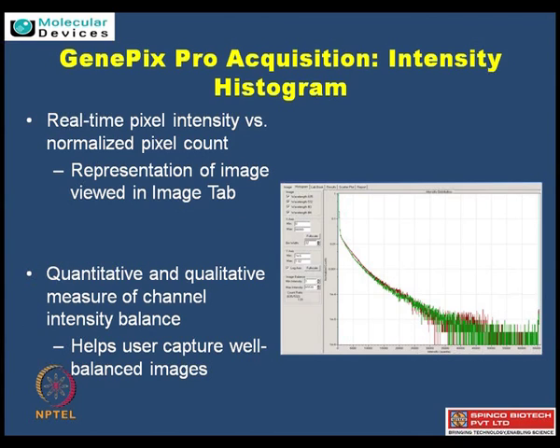to the histogram graph. Right. There, what it gives is how much red and green channels are contributing towards the intensities. So you really want that they are overlapping, so they are really balancing. There could be a small variability in the beginning owing to the fact that there is just a background and then the spots coming in. So there you want that they are really overlapping after a little bit of lag. That is a few seconds of lag.